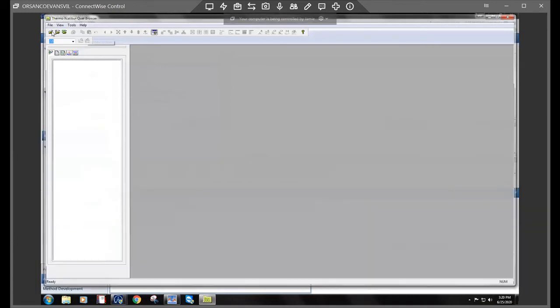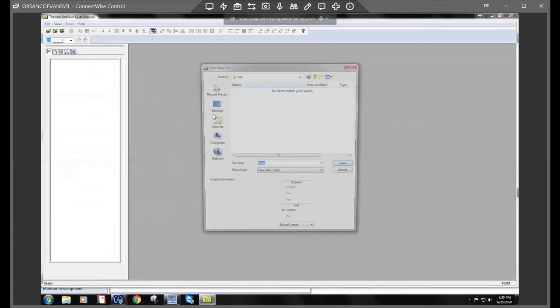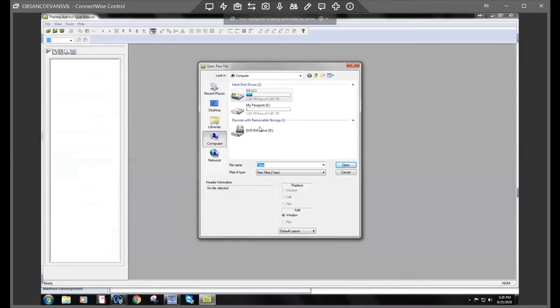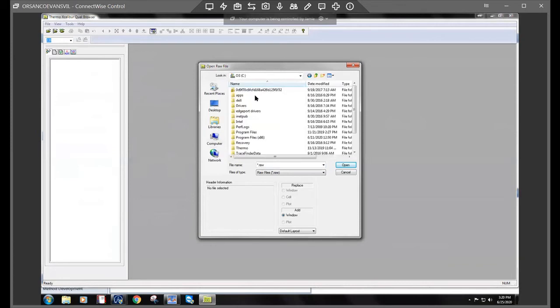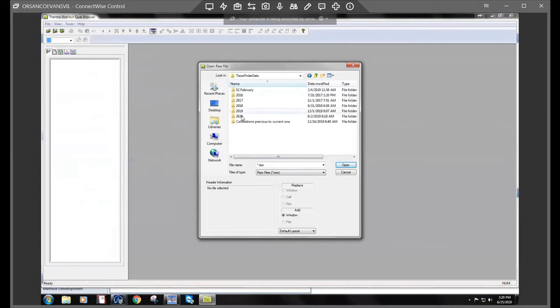Go to the open folder, computer, c drive, trace finder data, 32 projects, the year, the month.